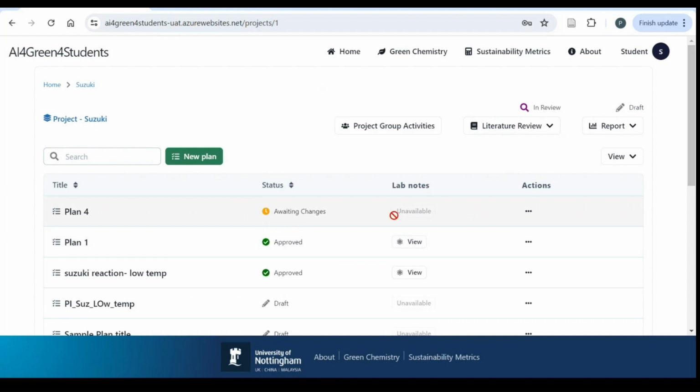So how this works, looking at it, you can see that you have the plan and the notes side by side, because it might be that you will vary your reaction within the 4 weeks you stay in the lab. Maybe in week 1, you're looking at one condition. Week 2, maybe you're looking at another condition. So for each reaction you're looking at, you're creating the plan that you will submit to your supervisor. At the same time, you're documenting the notes that go with that particular reaction.